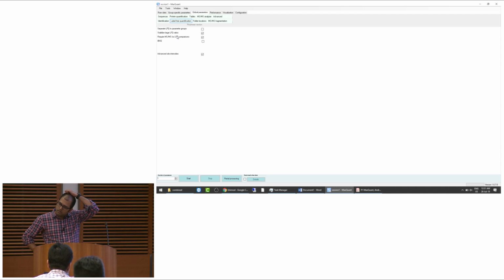Then it would only do pairwise comparisons between a pair where at least one of them has an MSMS. Yes. But would it do that one file with a pairwise comparison against the others at some point, so that you would be able to get that ratio? So I think you will have an LFQ value only in that sample 10 then, or no?